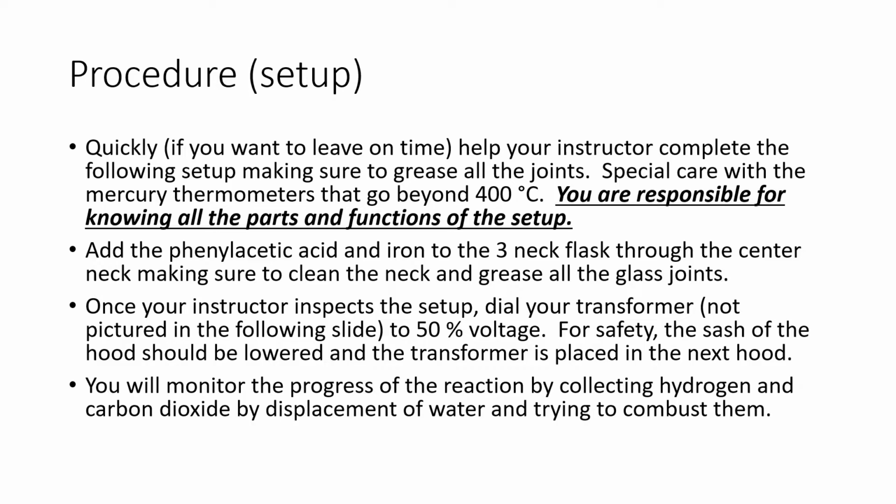So for this experiment, we will be using very special mercury thermometers that can go all the way up to 400 degrees Celsius. These thermometers tend to be quite expensive, so it's very important that you stay careful with them. Also, when you set up glassware, always make sure to grease the joints. That way when we set everything up, we can easily slide in our pieces back and forth.